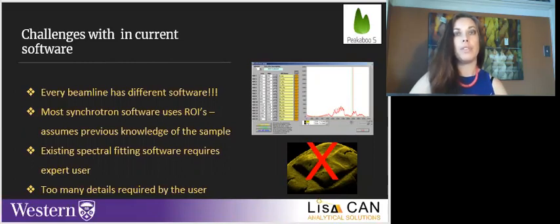The software for full spectral analysis that does exist requires expertise, both in software and in XRF. Before Peakaboo, students needed 1 to 2 years just to become familiar with the software. That's 2 years where the data collected is not informing next research steps. And in other software, the fitting of peaks is done by the user, so misassignment occurs regularly.